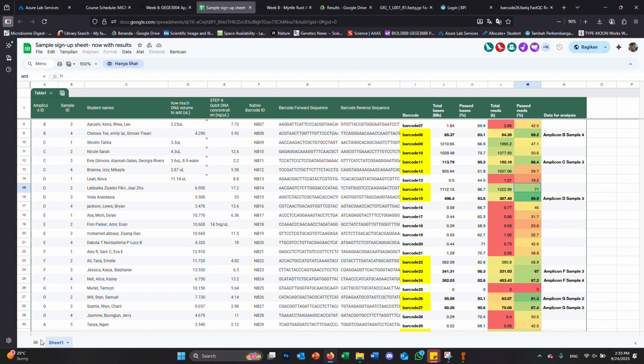So it's this automated analysis software that takes all of the 8 amplicons from your sample and performs a similarity analysis to the known strains. Now, what we discovered, because not every single sample worked, was that we were missing some of these amplicons. There was not one sample that had the full set of amplicons that worked.